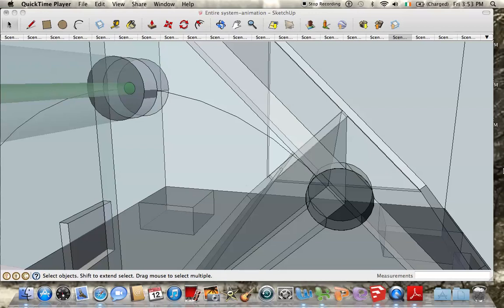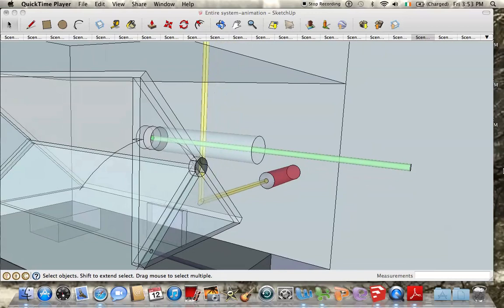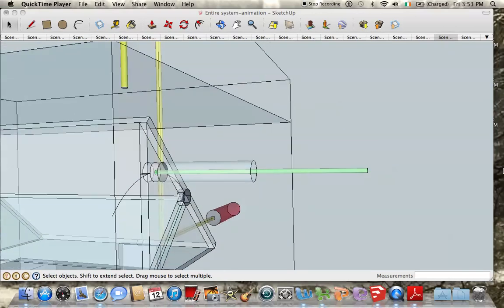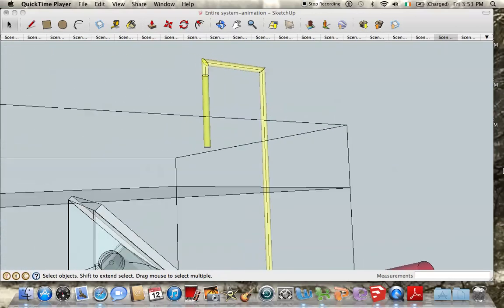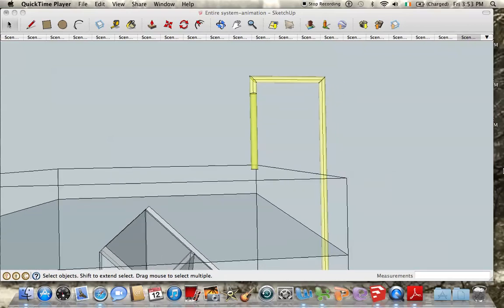As the magnet passes the copper coil, a small electric current is generated. This current passes along the green wire, which is attached to a computer. Every time the bucket tips, a current is generated and the computer records it. When the bucket tips, it releases the gas into the headspace and the gas exits out this yellow tube.